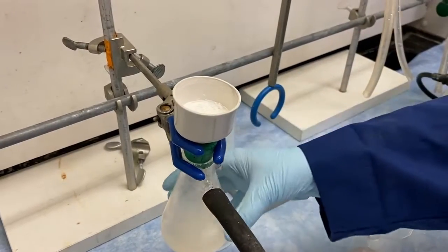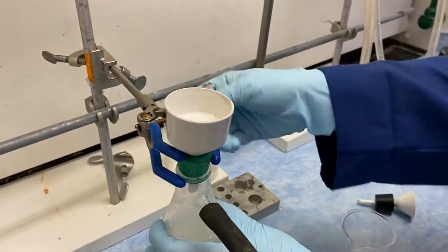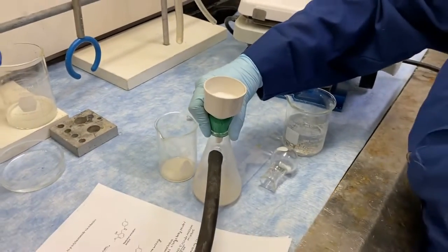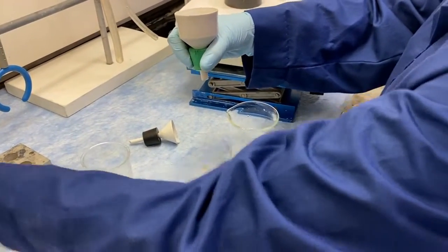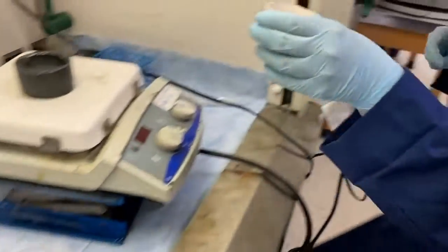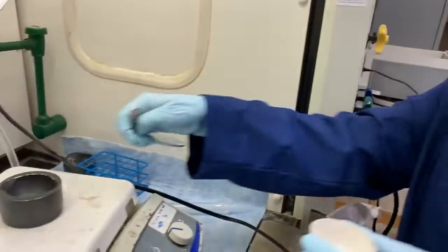Okay, so now we've got the crystals. I've been filtering for a little bit. We're gonna take them off the filter paper, like we always do. We're gonna go ahead and put them under the lamp on our watch glass, like, again, we always do. Miss Karen, she's getting the watch glass there.